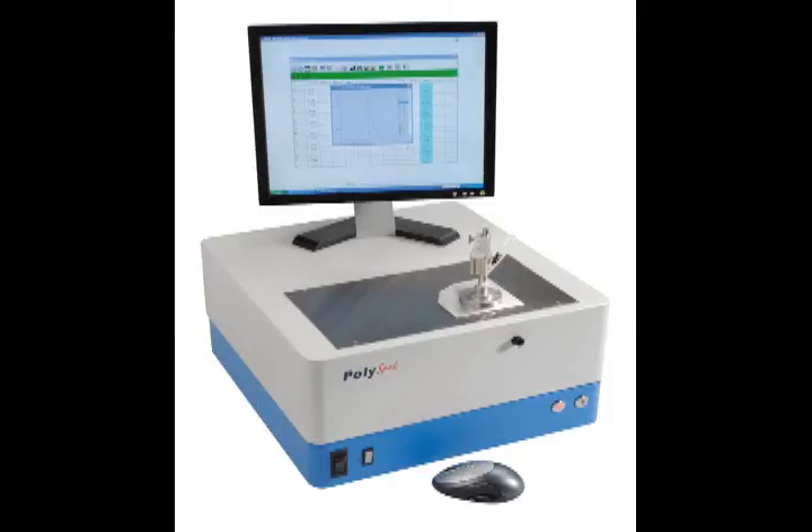The PolySpec is the company's most recent design, incorporating multiple spectrometers into one unit to provide a powerful yet very compact package that can be used to analyze almost any type of metal.